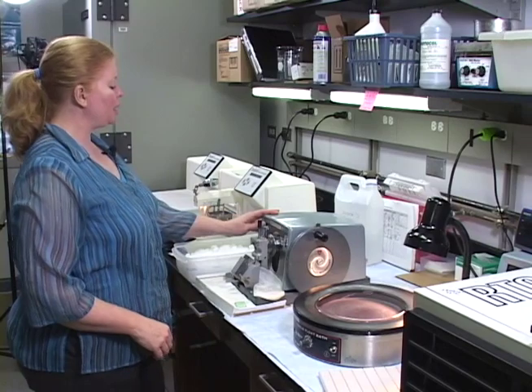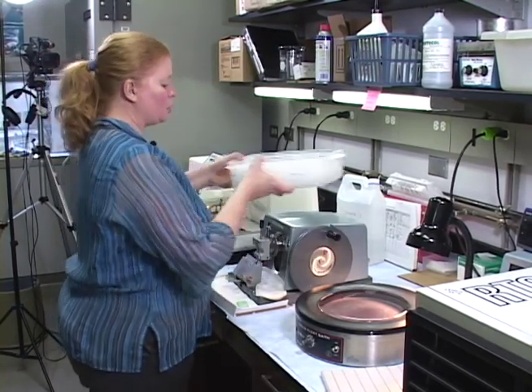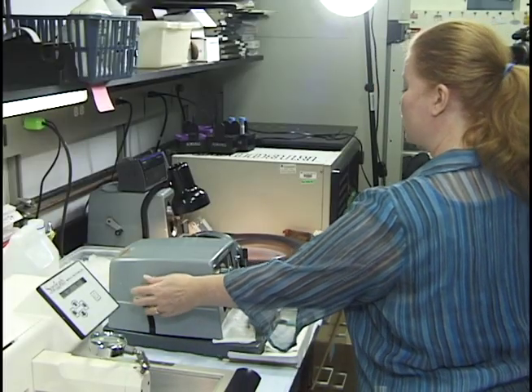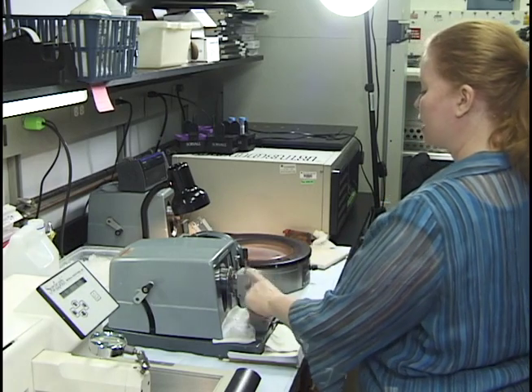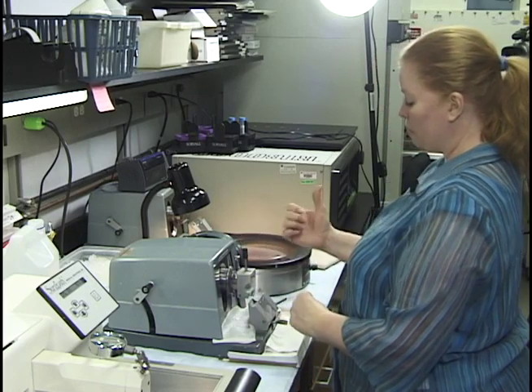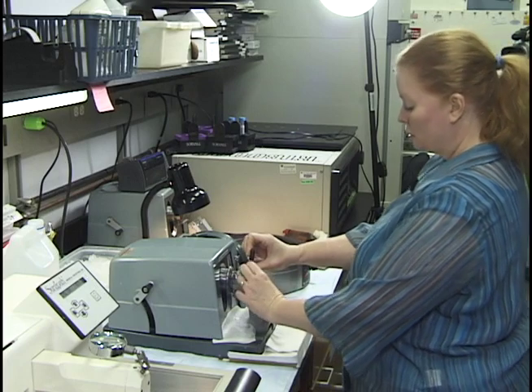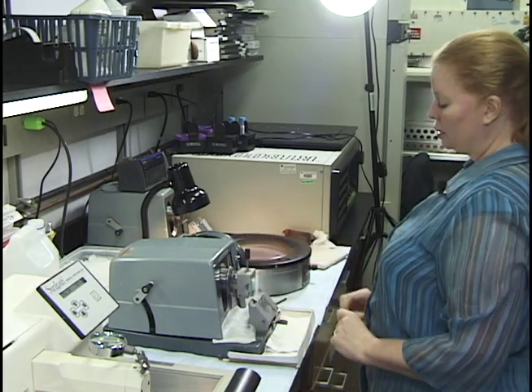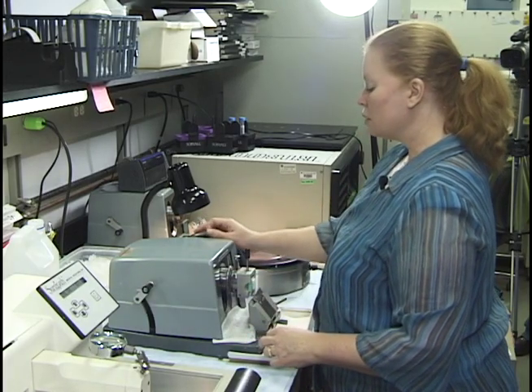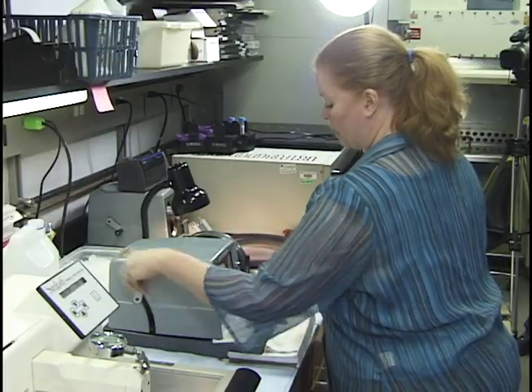So we've oiled our machine and it's running smoothly. This is the flywheel. I want to show you on this side of the machine over here. This is called the advance and retract wheel, and this advances and retracts the block chuck. So I'll put this in, leverage it with my thumb, use my fingers, put the block in nicely, and I'm going to retract this.